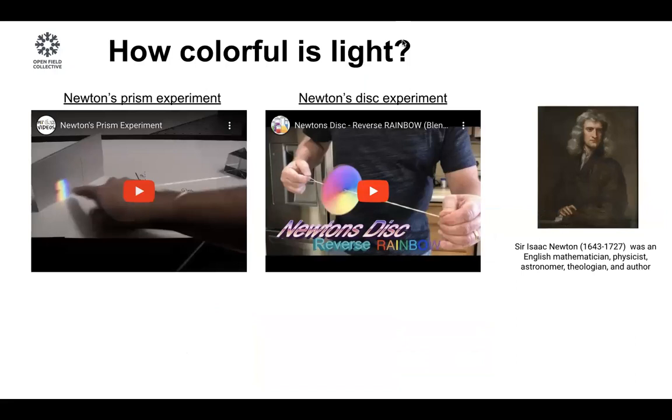So spectrophotometry is one tool that can be used to do that, and it is also the gold standard. It's not that we are reinventing the wheel or we are starting a new technique that has to be validated. All we are trying to do is scale down the cost of doing spectrophotometry and making sure that the quality of the data is good enough.